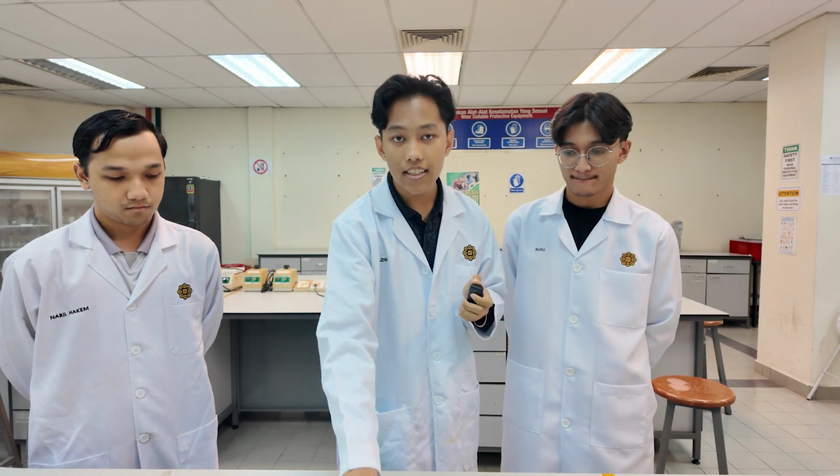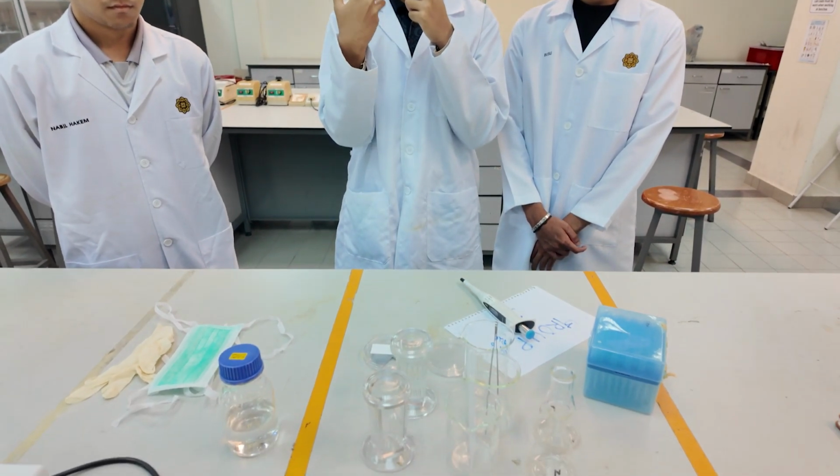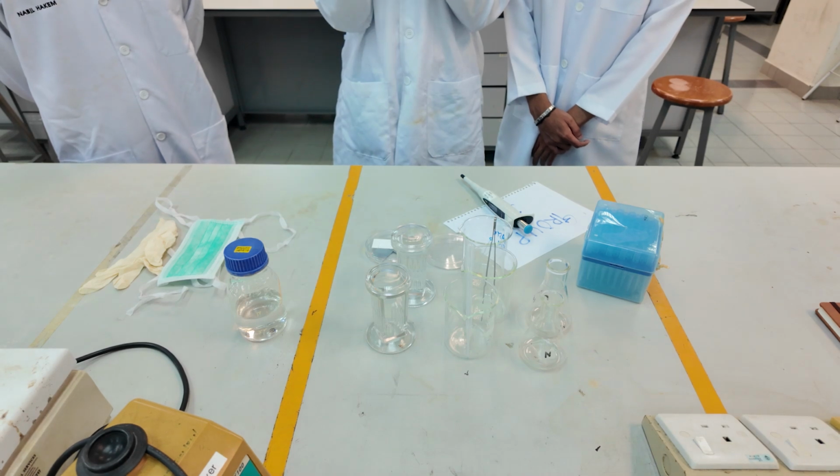Next is chromatography, which is the C from TLC. Chromatography generally means a separation process. It comes from a Greek word which means color writing. Chromatography is a separation process based on movement through a stationary phase under the influence of the solvent.